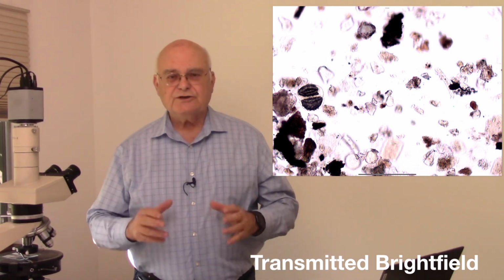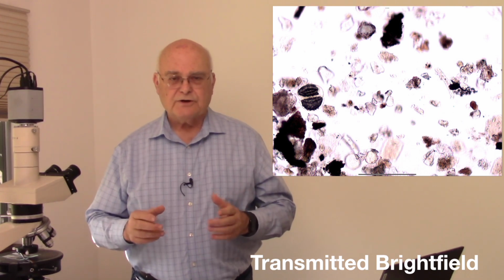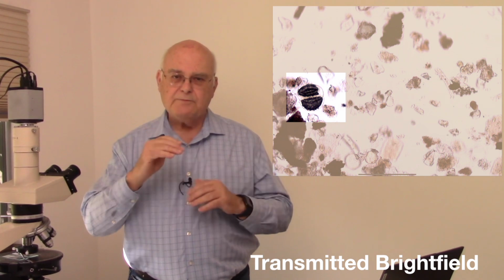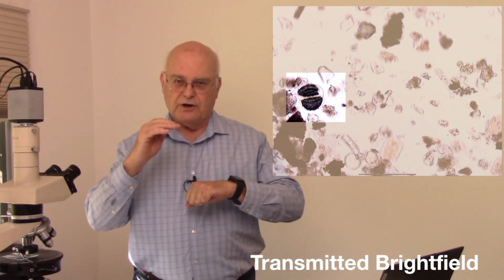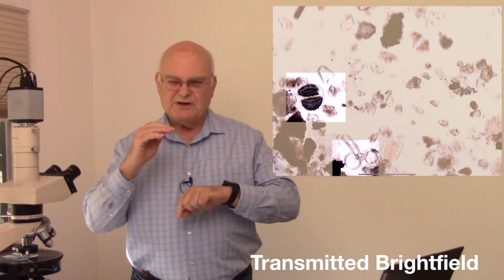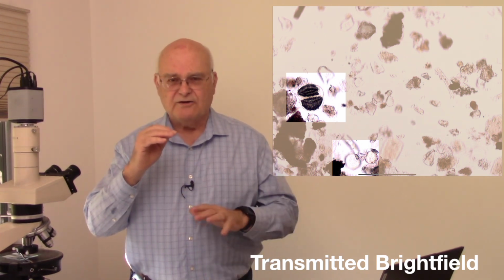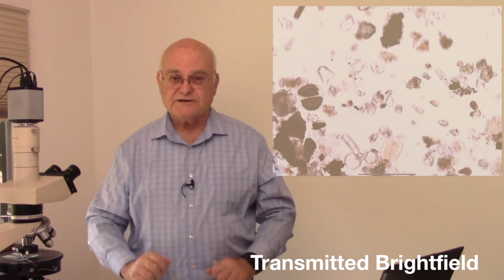So this is the condition that we normally use when we're examining particles under the microscope so that we can see more detail. But you'll notice with our pine pollen in sharp focus, the small pollen that was on the lower left side is pretty much only indicated as kind of a circle of light. We lose the detail that we saw when we had an axial beam.